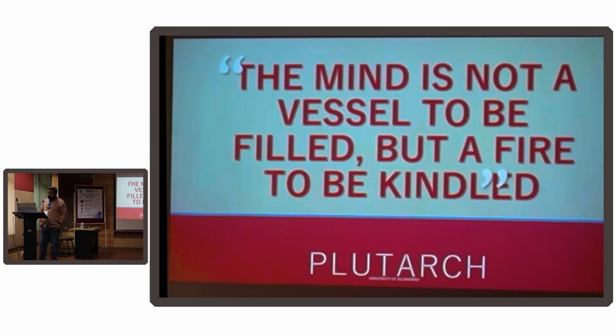but using those you can make your own arrays. I mean, there are companies like Pepperprint and Ray Biotech, I think. In India you don't have it, you have to go abroad. You have to talk with them. They can make you custom chips, but you can do it. It's not impossible. If it is a protein or a peptide, it will definitely bind with someone or the other. You can do DNA protein interaction studies.